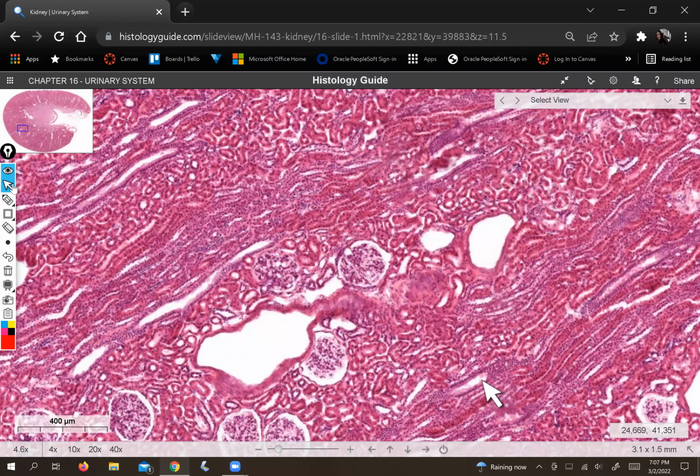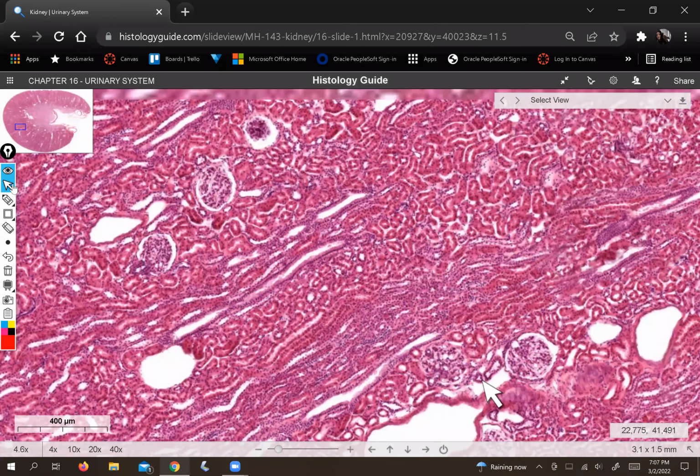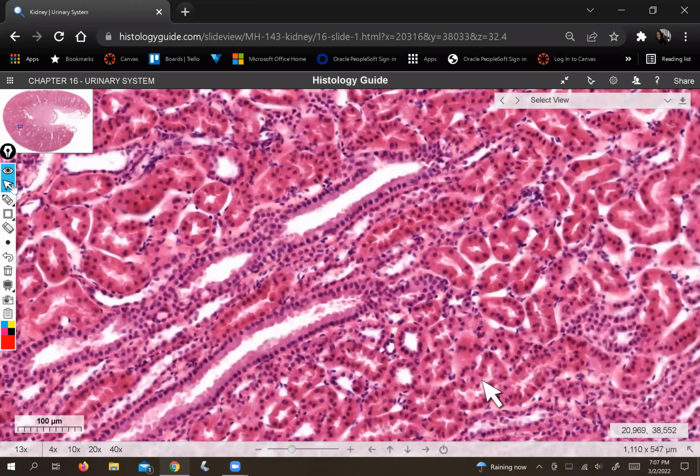Okay, you can also see the collecting ducts as they descend within the medullary rays. I see lots of PCTs here, so we're still in the cortex. We haven't made it into the medulla yet, but with this collecting duct and this one too, the transition from cuboidal to columnar cells has already begun. By the time this collecting duct gets to the area next to the renal papilla, the very tip, these cells are going to have changed to be fully columnar and also lighter staining.